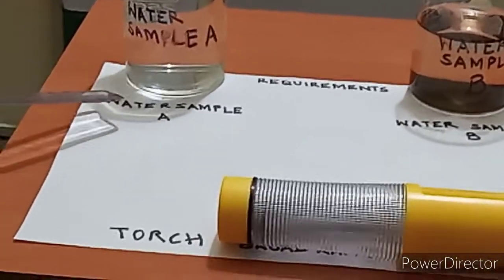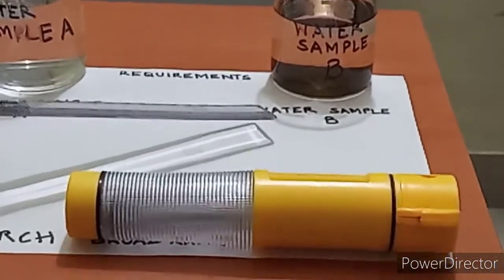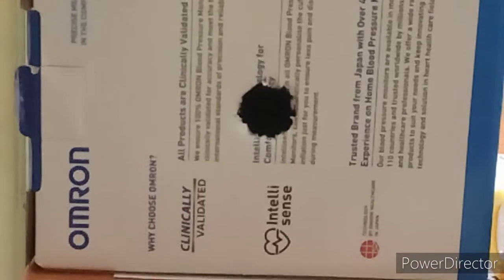the water sample A collected from the tap and water sample B collected from the pond, the torch, and the cardboard box, which is a closed box, and we have made two holes, one on this side and exactly the other on the other side, and this is the open region of the box from where we can keep the beaker inside. So we will be starting the experiment now.